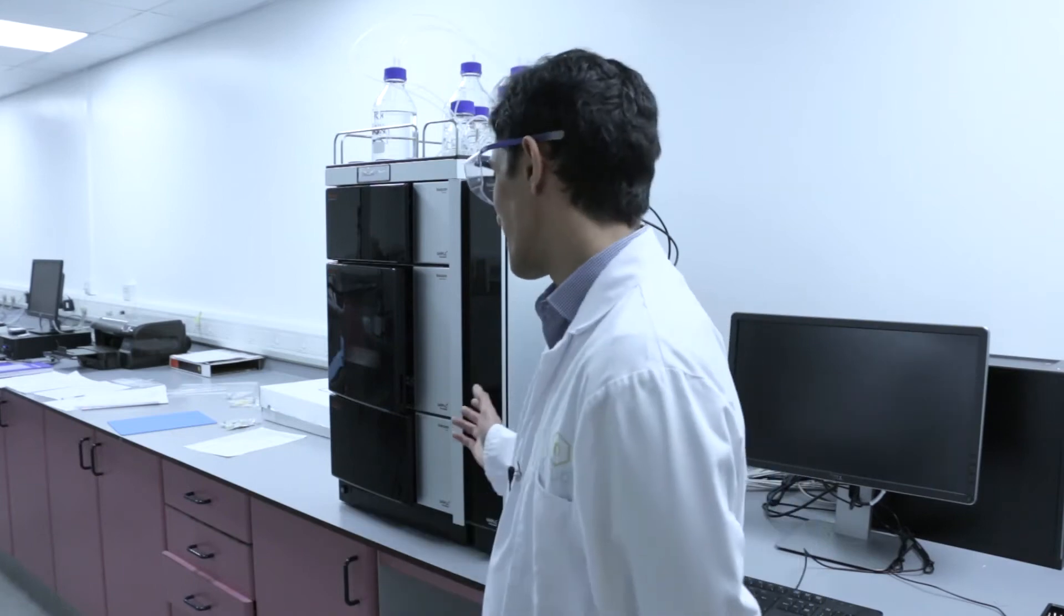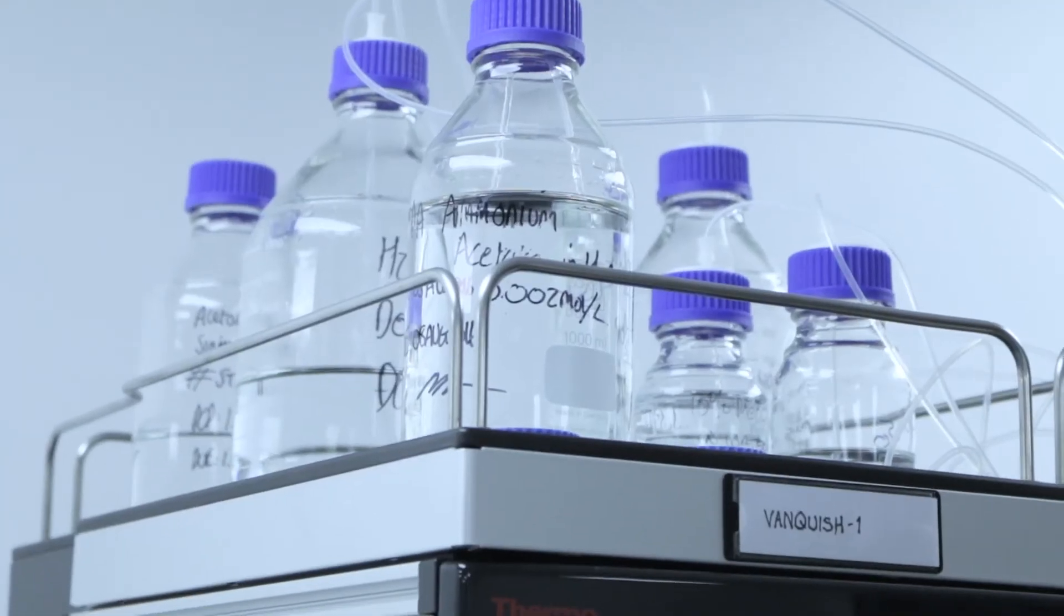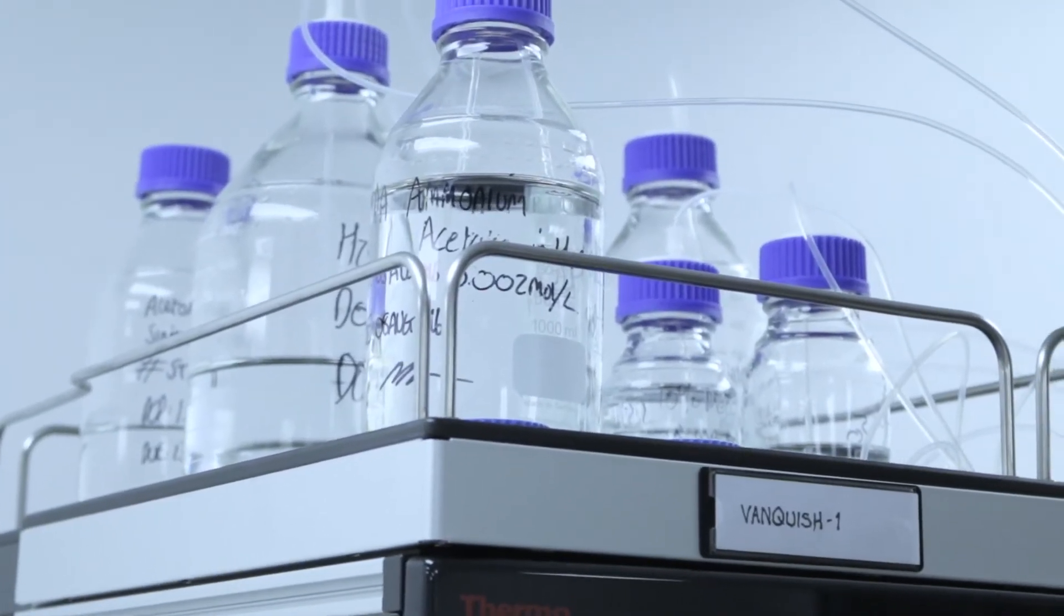This is our UHPLC, that's our ultra high performance liquid chromatography system and we use this to analyse liquid samples that we generated on the vaping machine. We analyse the samples for nicotine content and also for the levels of carbonyls. Through this we can understand the emissions of electronic cigarettes and e-liquids.